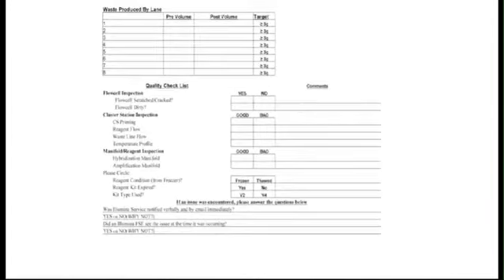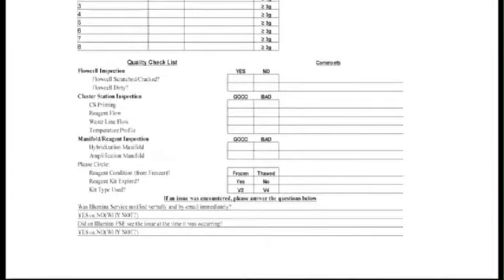The quality checklist at the bottom of the page is where we note information about the condition of the flow cell and the performance quality of the cluster station. We also check for proper priming, flow, thermal profile, and manifold functionality, and make comments about anything that might help us later. The information on this page can be extremely helpful when we need to troubleshoot downstream failures.